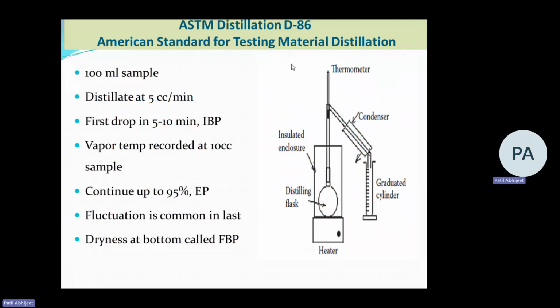As per ASTM distillation, because if you are preparing any product related to petrol, diesel or biodiesel, there are certain standard processes which are reported to characterize this, meaning determination of flash point, fire point, and separation. These methods have certain names, D86 as per ASTM standards. Then some other standards are also available.